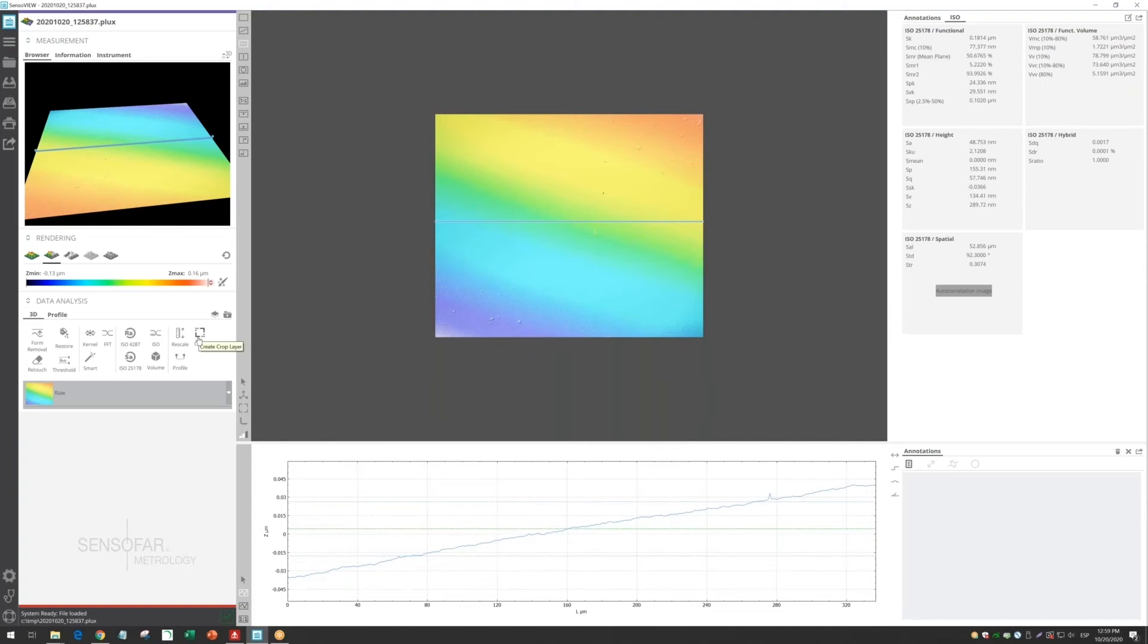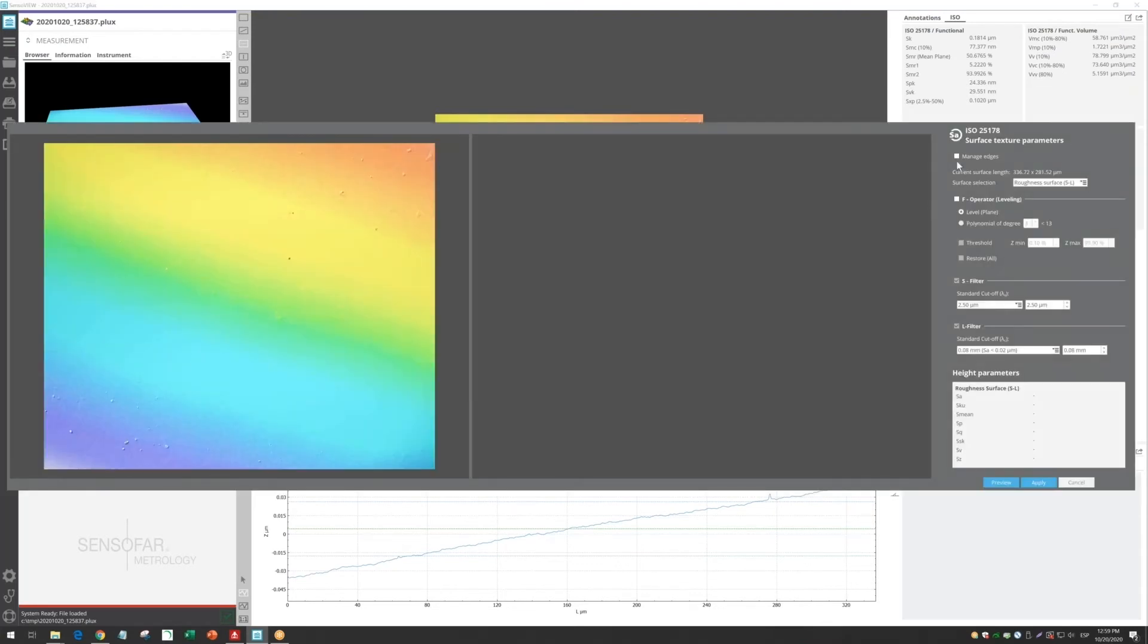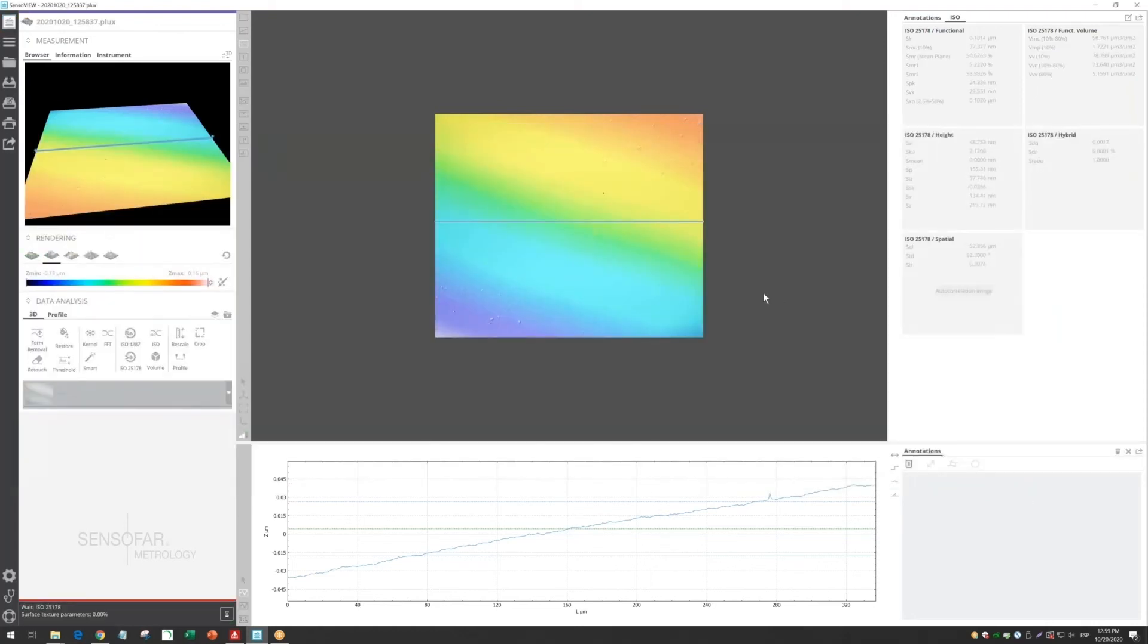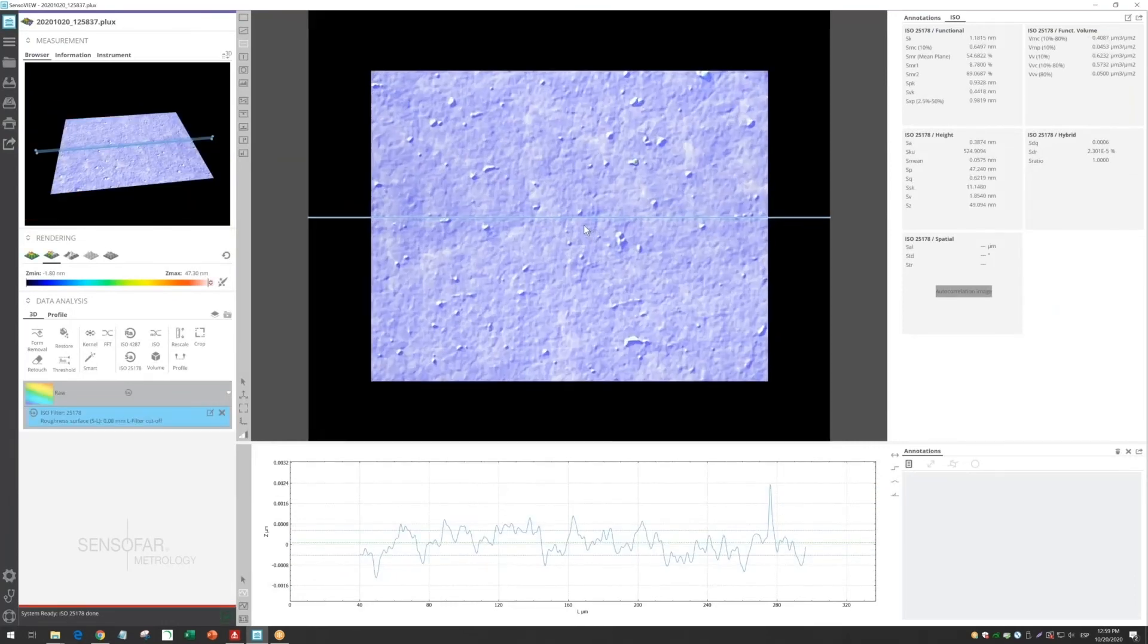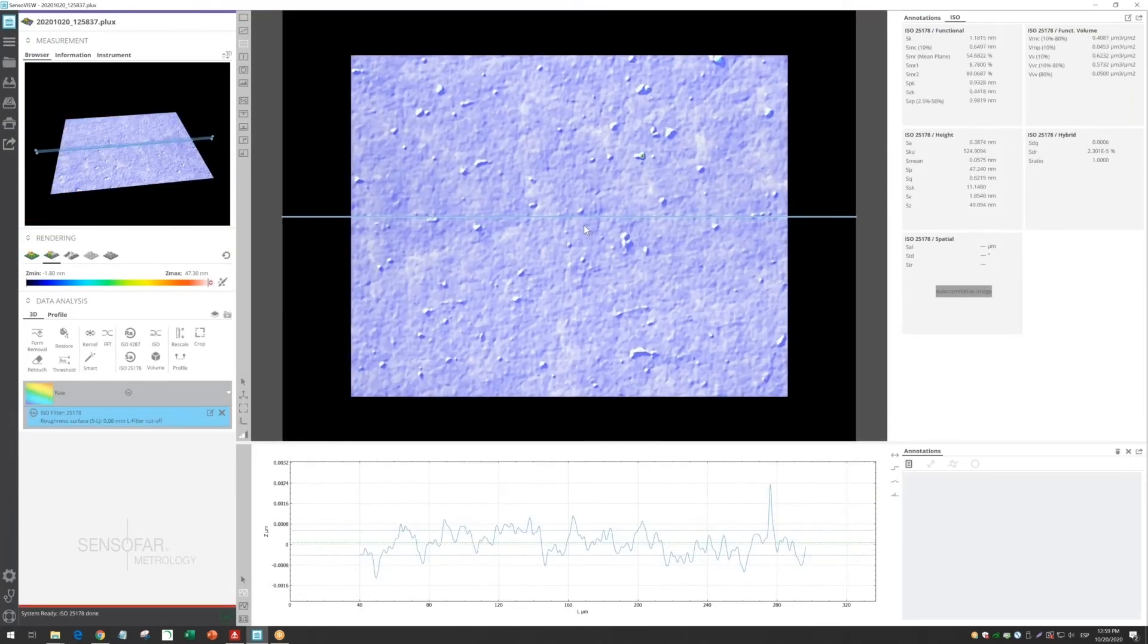If you want to calculate roughness values, we recommend to go to the ISO 25178 wizard, click here, and automatically it's recommending which are the best settings to calculate the roughness value. Click apply, and you will see now that all the surface looks like after filtering.